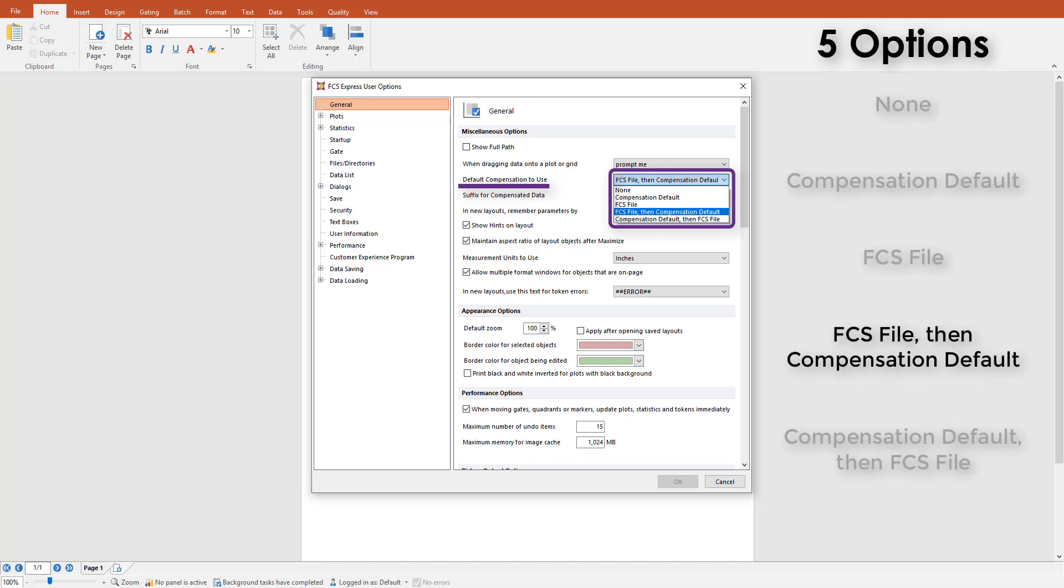The fourth option is FCS file, then compensation default. FCS Express will read the data file's header and display that compensation, and if it is not present in the data file, FCS Express will look within the layout for a compensation default.